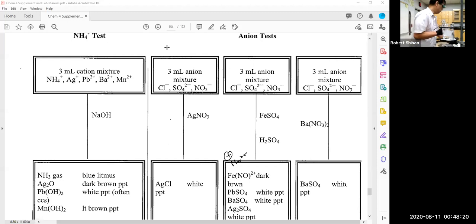Okay, so I'm going to stir it up now and make sure all the precipitate that can dissolve has dissolved. So I'm just crushing up the crystals, and I'm watching my fingers so I don't burn them because it's quite hot.